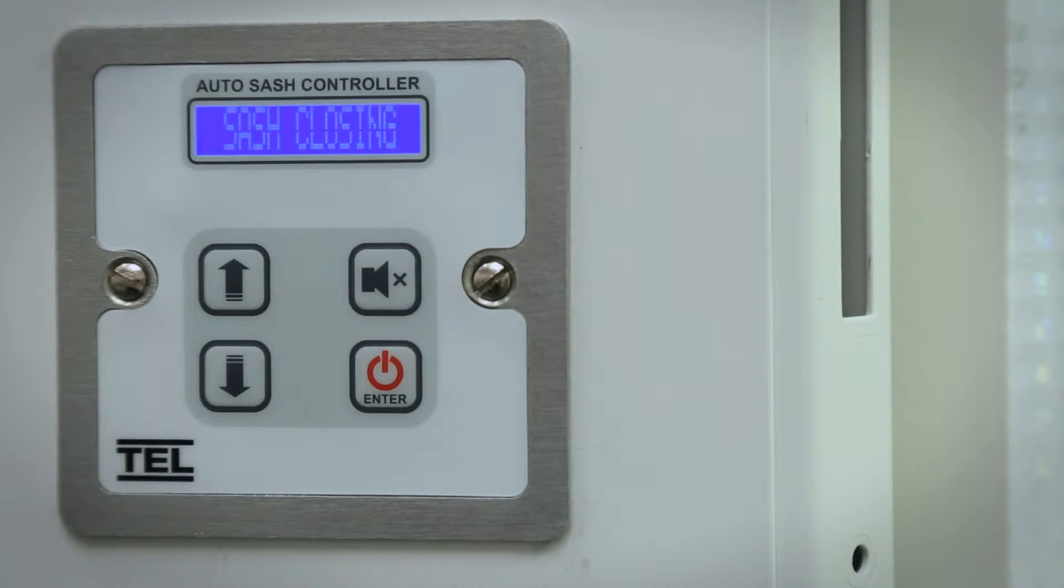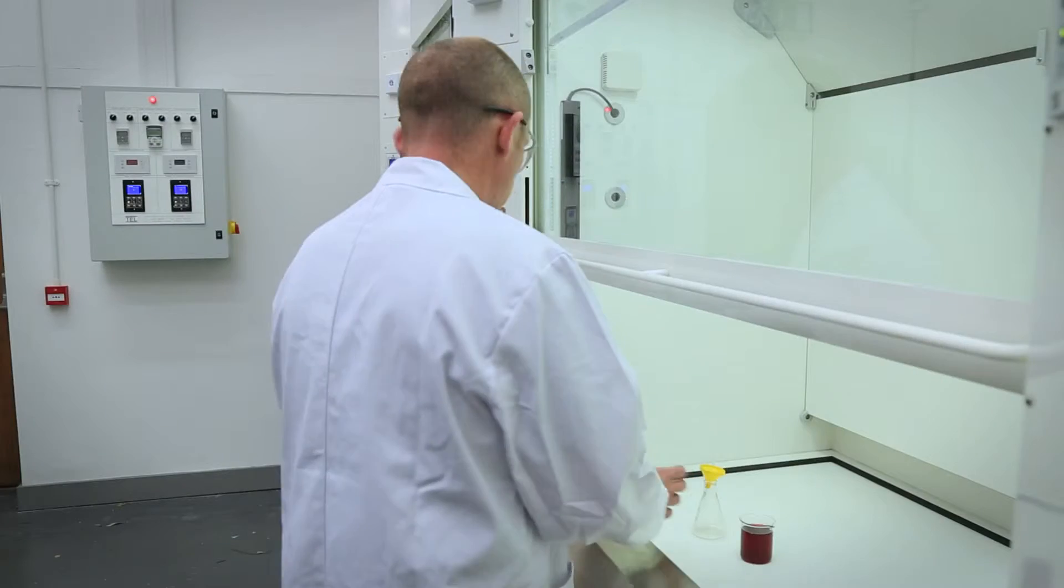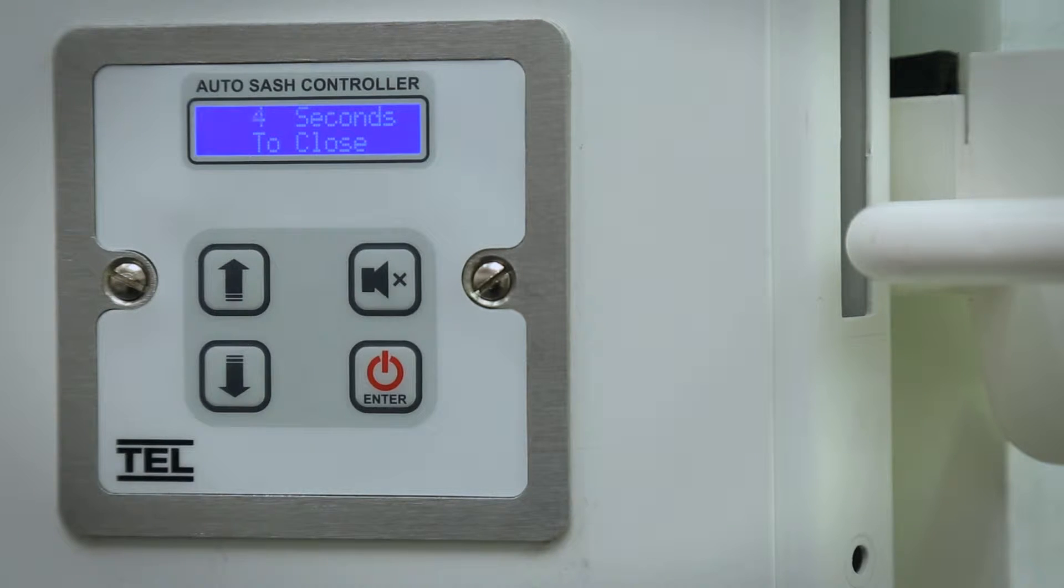The auto sash will automatically stop closing if a user is detected during the closing cycle. The sequence is reset once the user walks away.